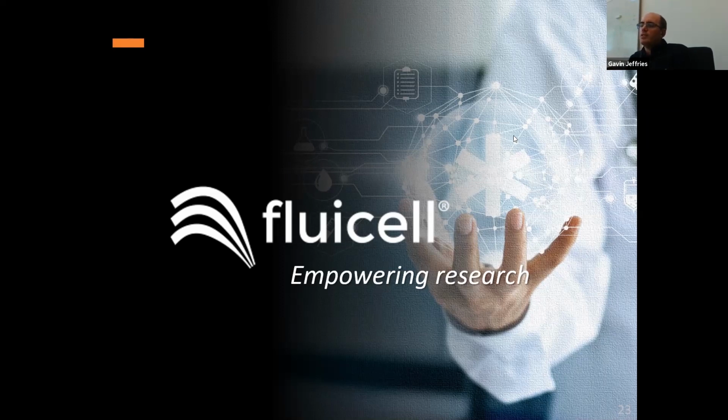When we're looking at the very small areas, obviously you do want to control the environment as closely as possible. When we're building at the cellular level, because we don't use any matrix, we can directly deliver whatever kind of compounds we want just in the media. We don't have to deal with diffusion that you would normally have to deal with if you bioprinted in a gel construct, for example, where you would have to pay attention to a buildup of waste products or change of pH or things like that.